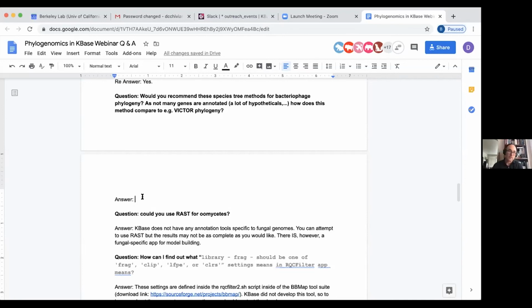The rough idea I would implement is to take that collection of phage and do an ortho-MCL to figure out the sequence homology across that collection, determine the core complement of genes.